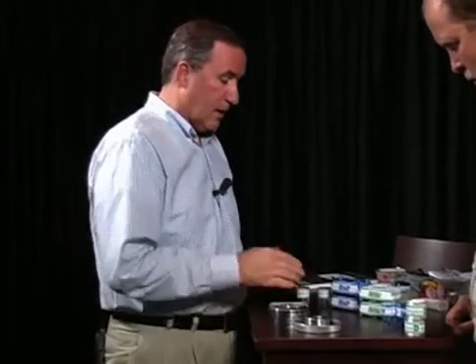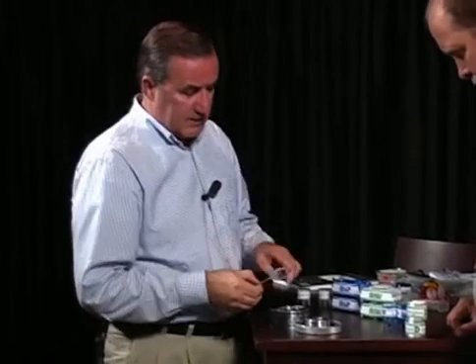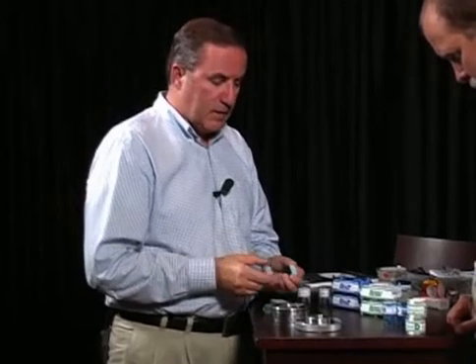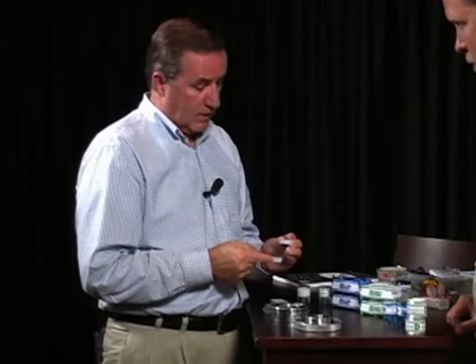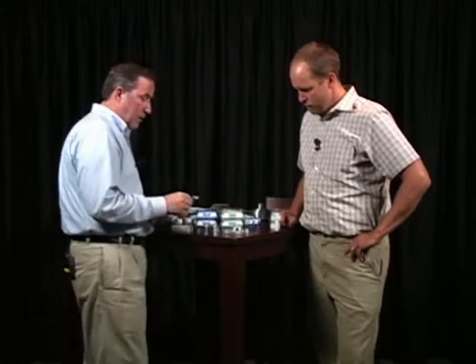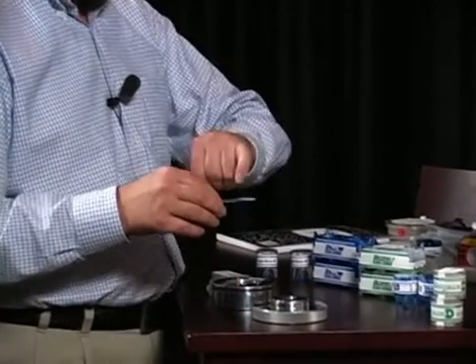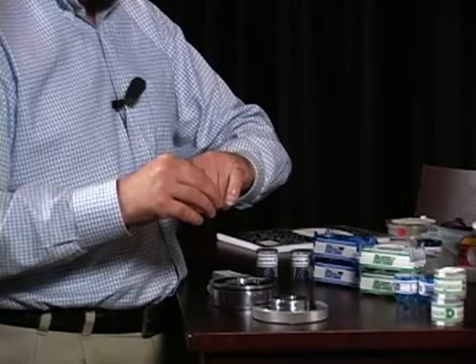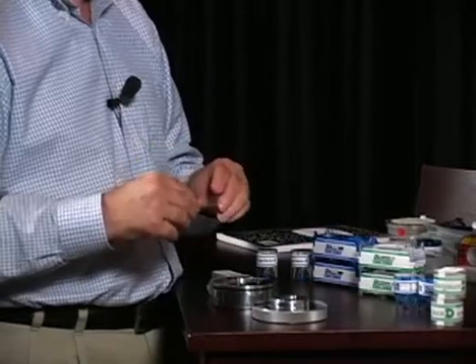This is a device that was made for forever use, before more disposable cassettes came along. This is a slide that has a pre-adhesive application. It's also got a unique barcode, so that you can track the sample. You want to make sure you put it in the sampling device adhesive side up. The way to do that is to take your baby finger and touch the edge, and you can see that there's no adhesive there. So turn it over and touch the edge, just enough to verify that you've got it adhesive side up, because there's the slit that you want to have next to the adhesive.